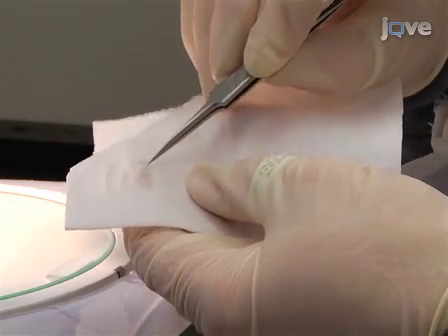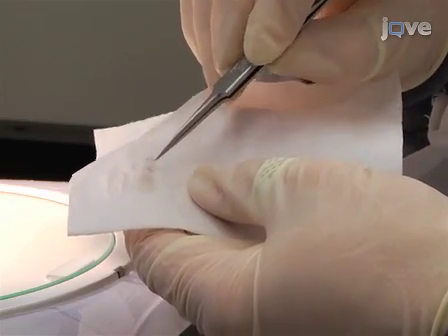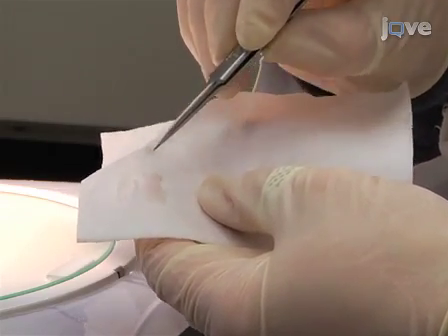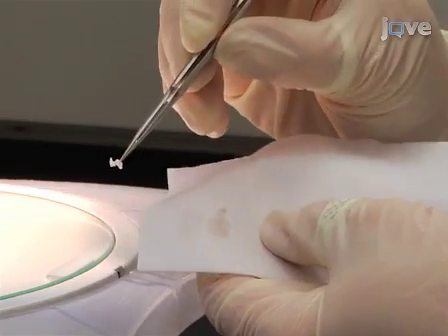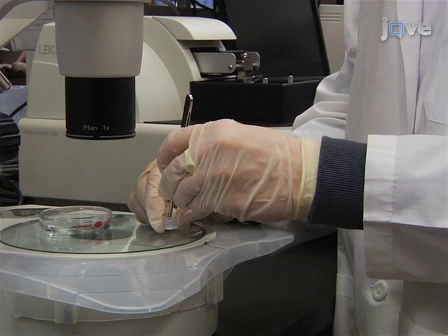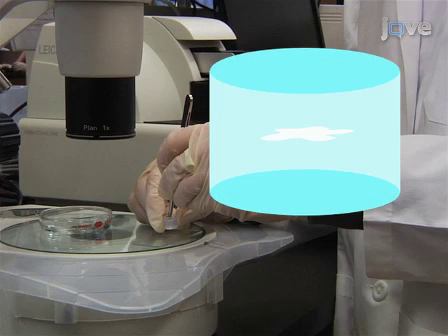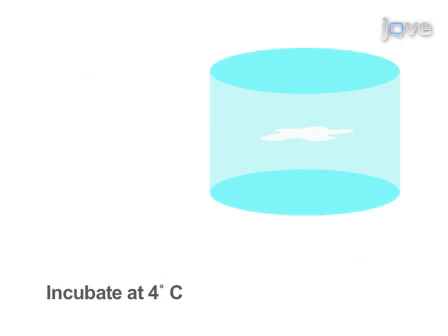Blot dry the lower urogenital tract tissue and submerge it in the agarose solution. Use forceps to orient the tissue so that it is suspended halfway between the top and bottom of the ring mold. Incubate at 4 degrees Celsius until the agarose has solidified.